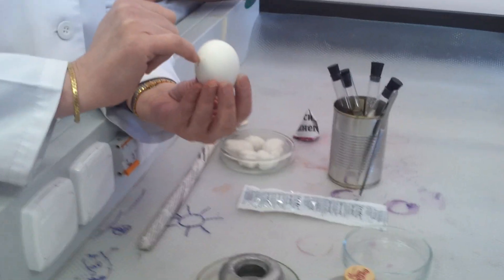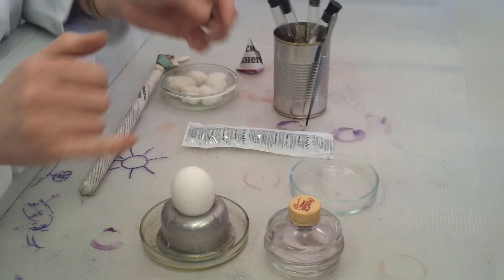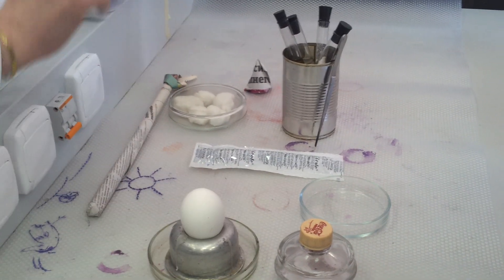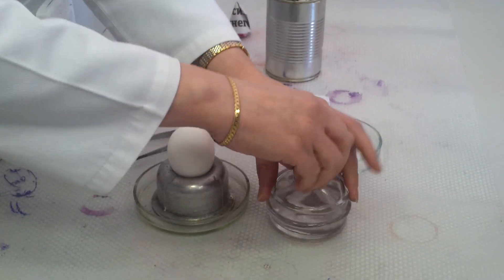The obtuse side will be on the top, because over here is the air surface. We will examine it. First of all, we need the burner.